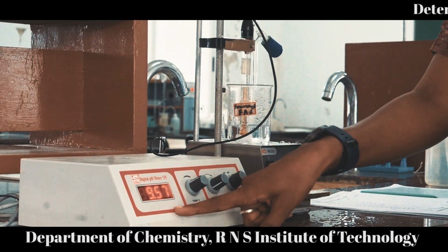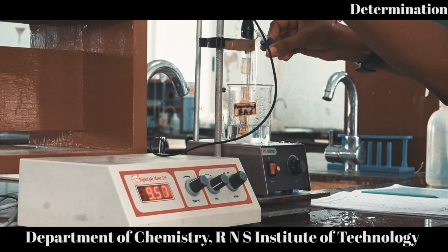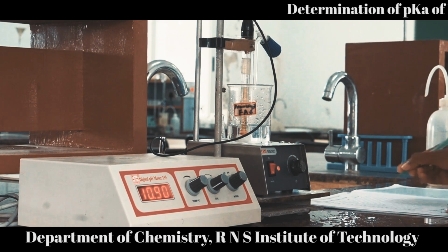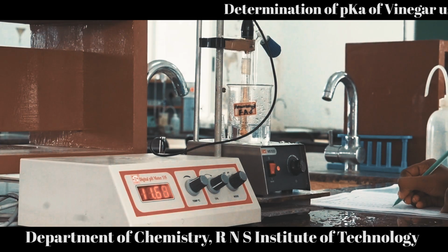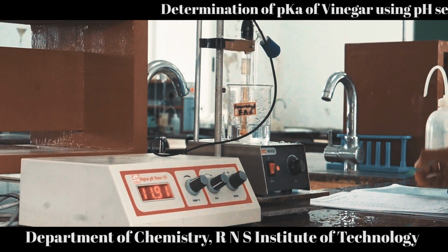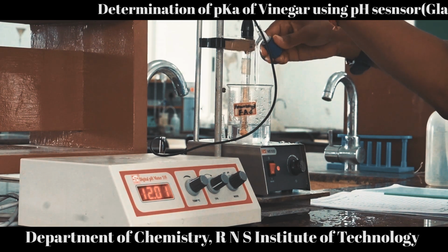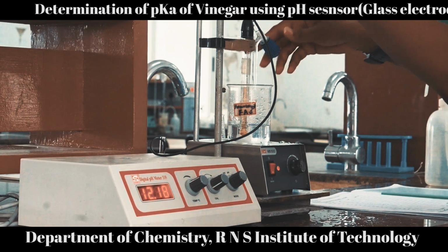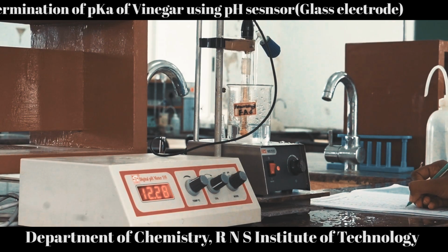After getting this jump value, just 5 or 6 readings have to be recorded.